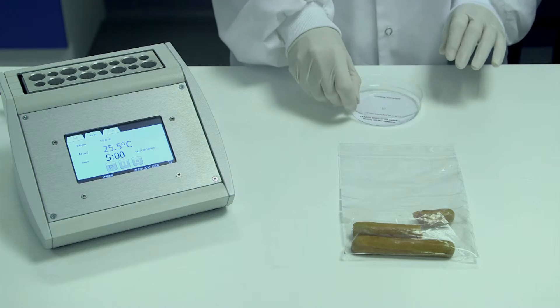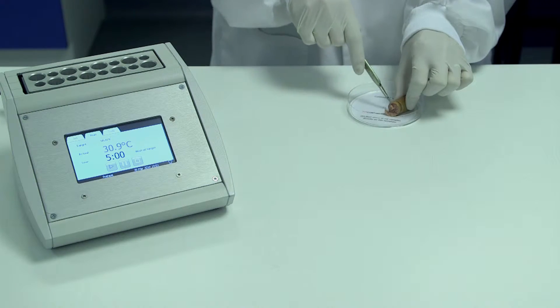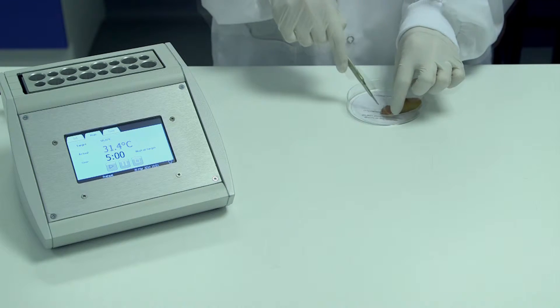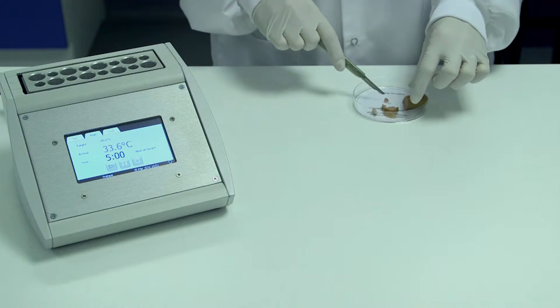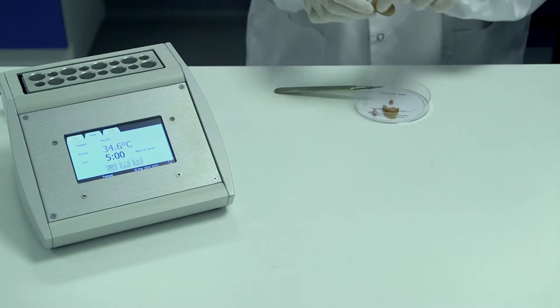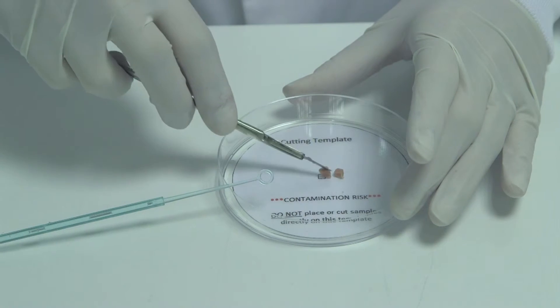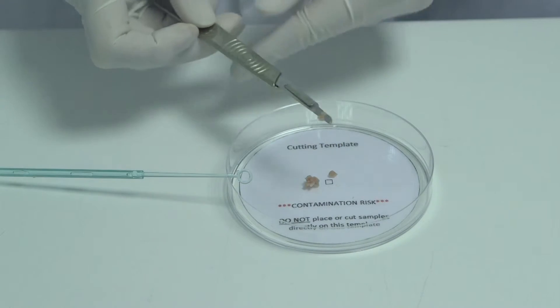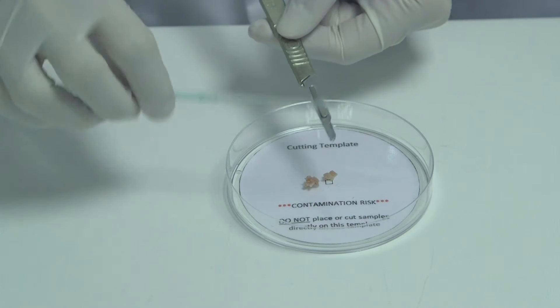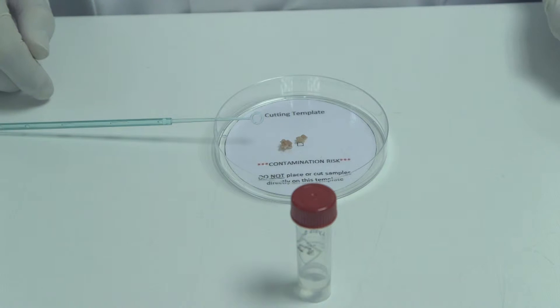Cut a small sample of meat using the cutting disc provided in the kit. This ensures that the correct sample size is used. Once cut, place the sample into the lysis buffer.